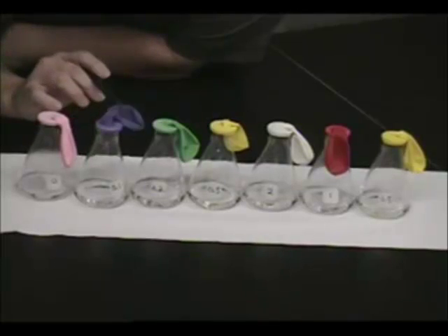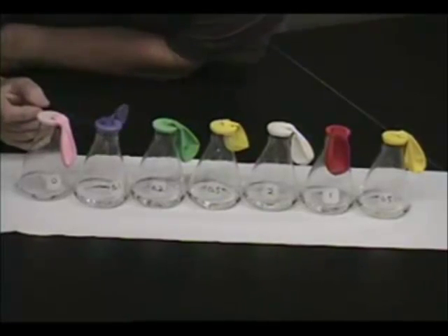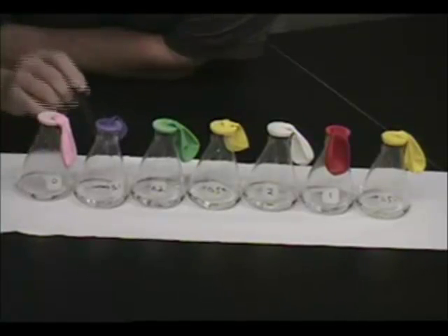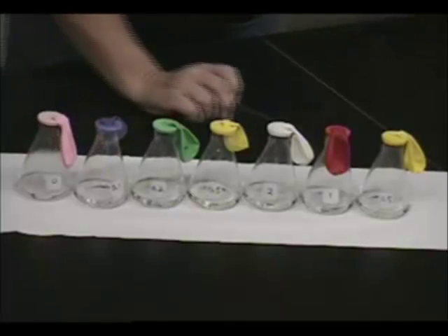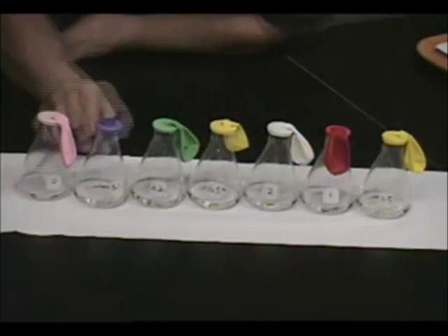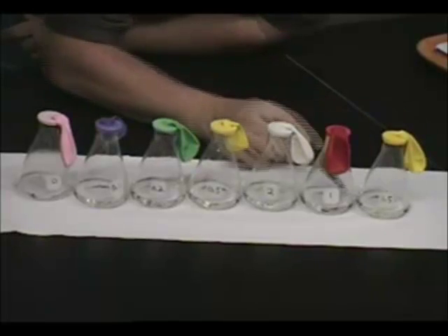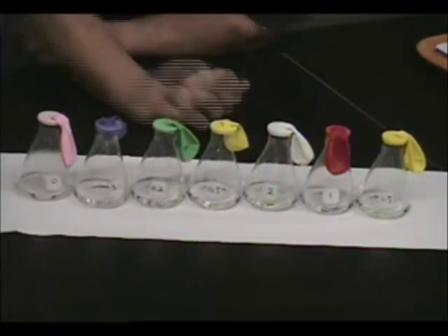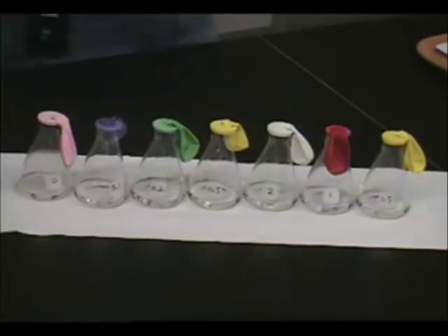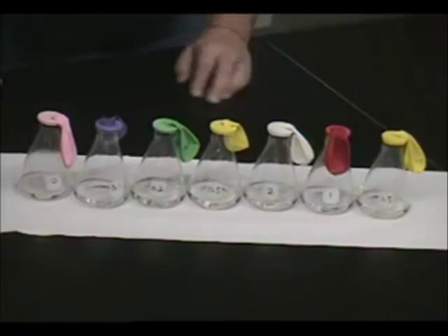We've got a balloon on each of these flasks, and inside the balloon is a small amount of magnesium metal. In the flasks themselves, each of these has exactly the same amount of hydrochloric acid, which is HCl aqueous. HCl is actually a gas, but if you dissolve it in water, you get hydrochloric acid, and hydrochloric acid reacts with magnesium, as you'll see.